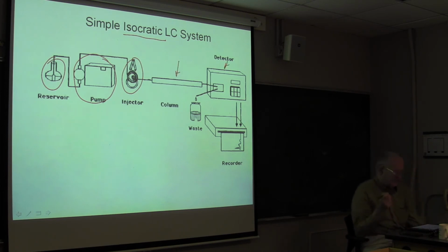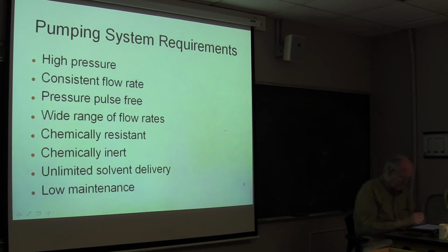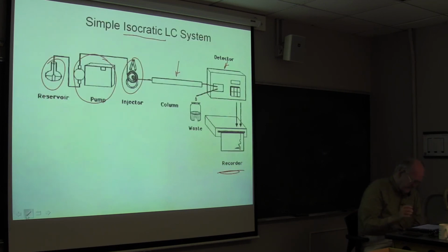You can tell how old this slide is because I'm betting any number of you have never seen a real recorder. Not a computer emulating a recorder, but a real recorder. Okay, this is pretty primitive. This LC will get the job done sort of, but it won't get the job done very well because it doesn't take into account a number of problems. I'll get to the problems in a minute.